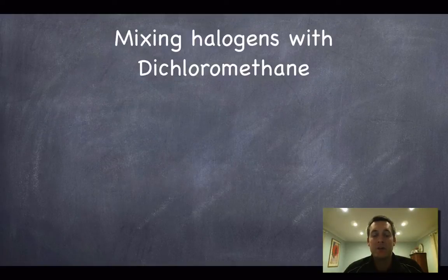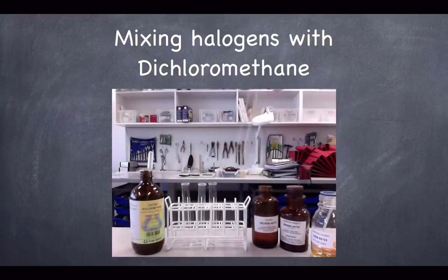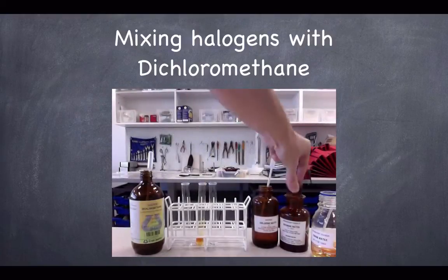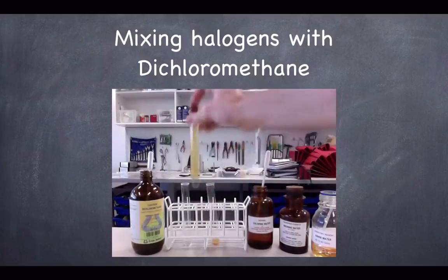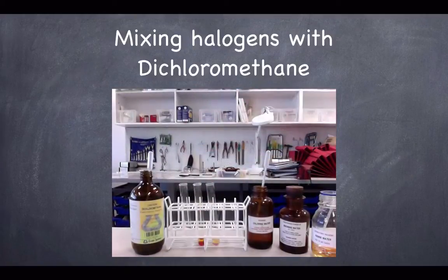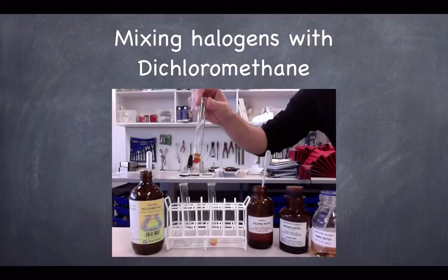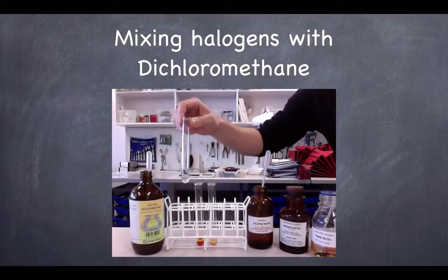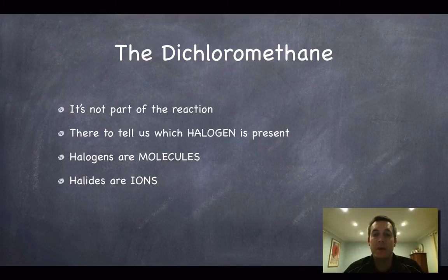The first job is to mix the halogens with dichloromethane, so let's have a look at that part of the experiment. Having put a bit of dichloromethane into each of the tubes, we put a bit of chlorine water, a bit of bromine water, and a bit of iodine water into each one, give them a shake, and see what colour they are. The iodine one is quite a nice shade of pink-purple. The bromine is reddish-orange, though depending on how intense it is it can look quite yellow. And the chlorine is most definitely colourless. It's really important to remember that the dichloromethane is not part of the reaction.